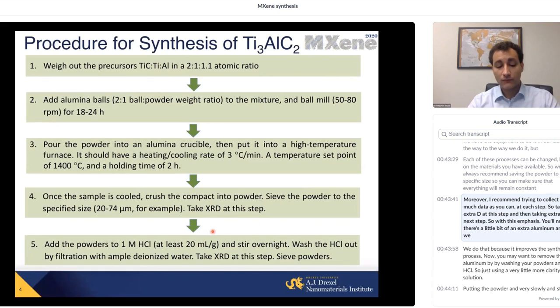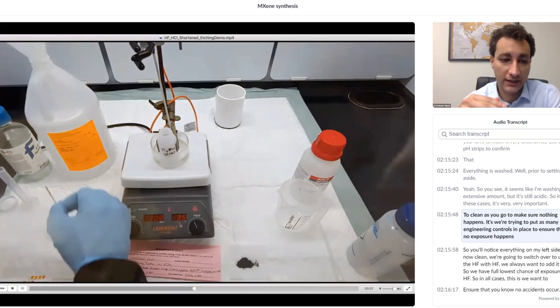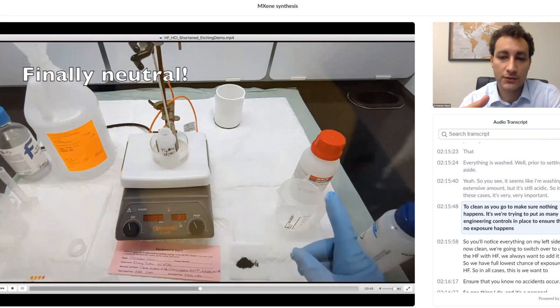So with this synthesis, you'll notice there's a little bit of extra aluminum, and we do that because it improves the synthesis process. Acidic. So in all of these cases, it's very, very important to clean as you go to make sure nothing happens. We're trying to put as many engineering controls in place to ensure that no exposure happens.